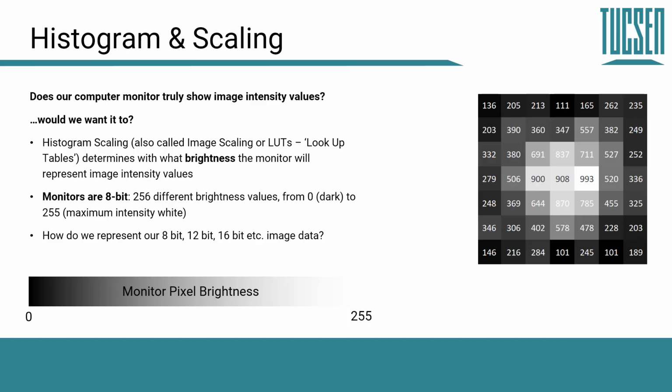That is our image scaling settings. And we are in software free to choose usually what these image scaling settings will be to match what our image actually contains in terms of its intensity values, and match our intentions and our scientific questions or our experimental procedures.